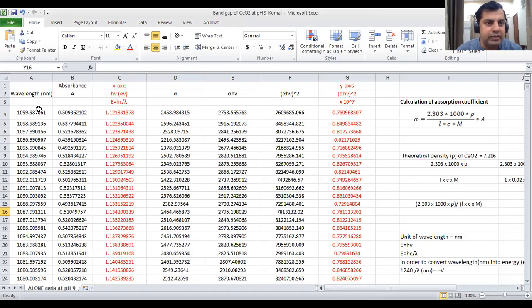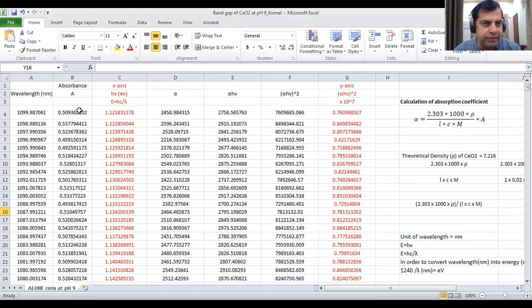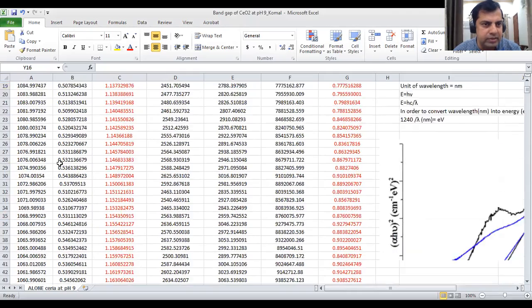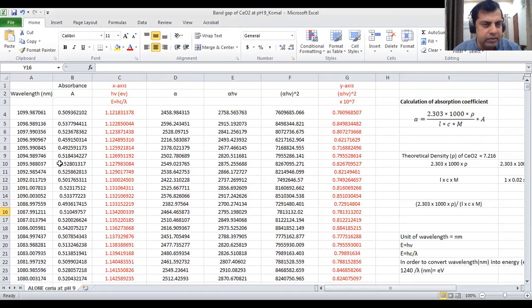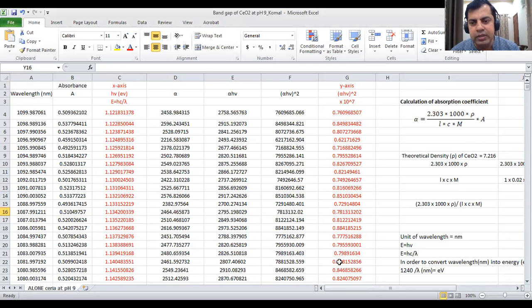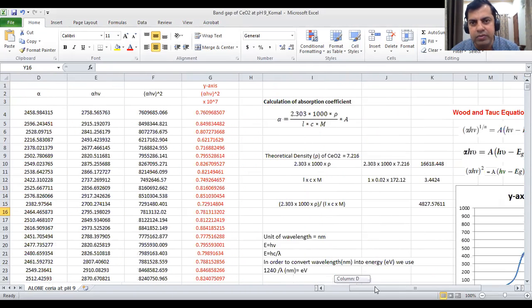First, you have to get the data using UV-visible spectroscopy. This data consists of wavelength and the change in absorbance with the change in wavelength — this is just the UV-visible spectrum. You have to export it into Excel or Origin, and then look at what the equation requires.